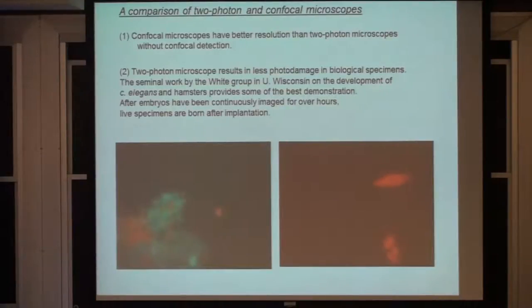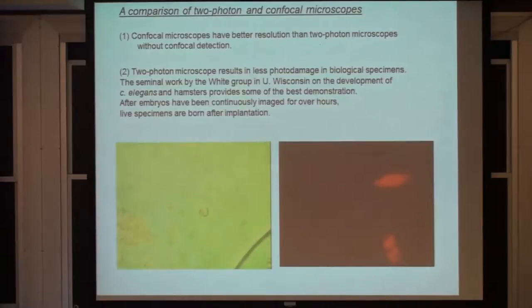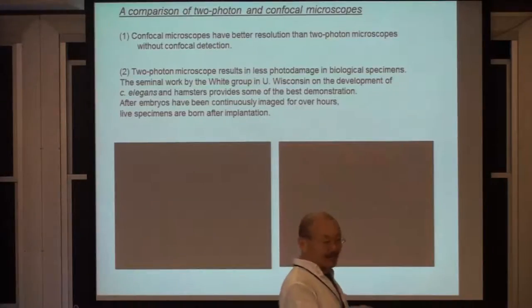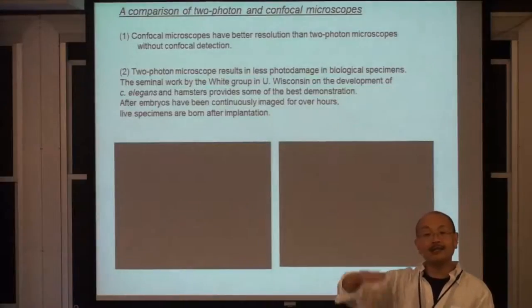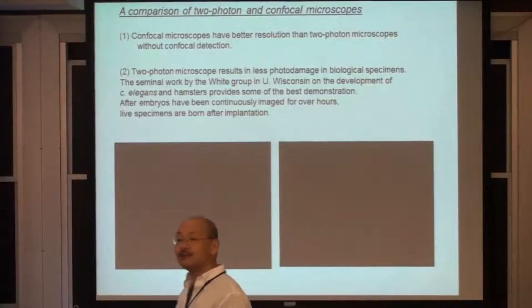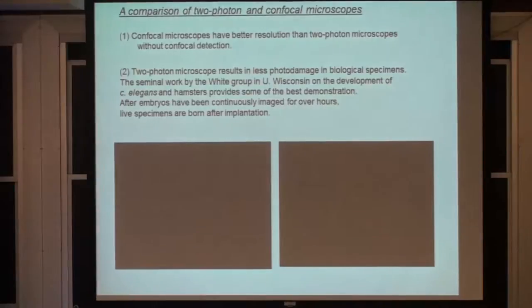But you can see the euglena start not to move so well. In fact, the euglena starts becoming round. Cell rounding is generally bad, and the movement almost ceases. This is all in real time. If you turn the light back on, the euglena is, I would say, dead at this point. One of the disadvantages of UV microscopy using a normal mercury lamp is that it is quite damaging. You are sending high energy radiation throughout the organism, and that generates a lot of reactive oxygen species that damage proteins, and that kills the euglena.